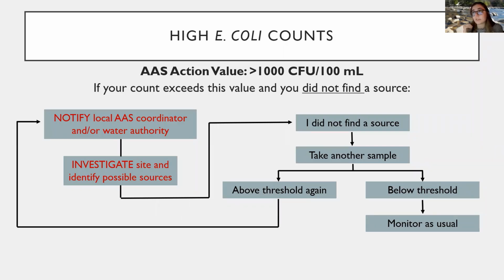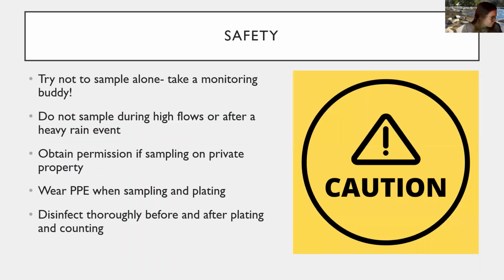But if it's above the threshold again, so you're above that 1,000 level, definitely want to follow up and say, I can't find what's making the level so high, but I got these results again. We need to get someone out there to do some more rigorous monitoring and find the issue, which these local water authorities are really, really helpful in getting done. So, all right. And then we have safety.